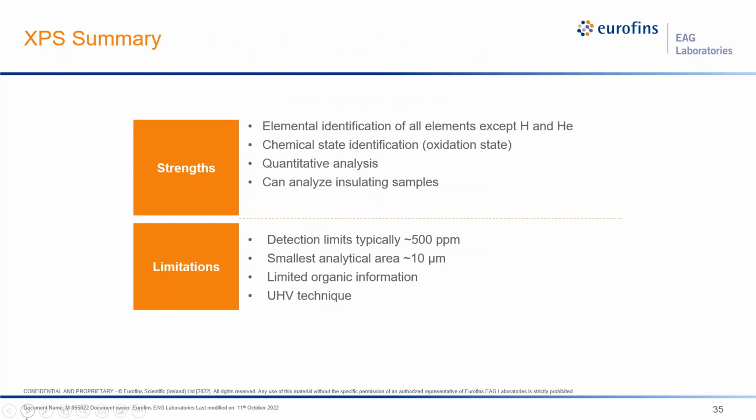The strengths of XPS include that it's capable of elemental identification of essentially almost all elements except hydrogen and helium. It can determine chemical states, oxidation states. The analysis is quantitative, and it can analyze both conductive and insulating materials.